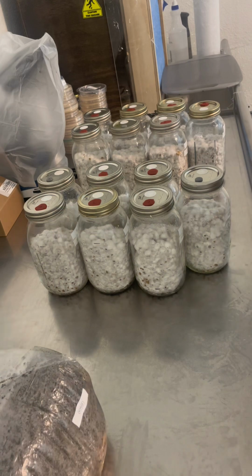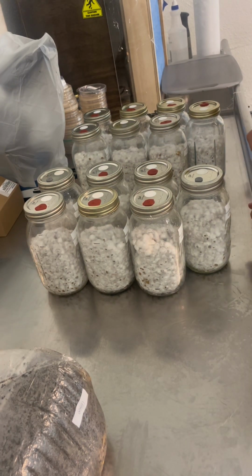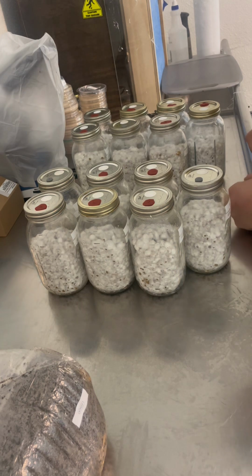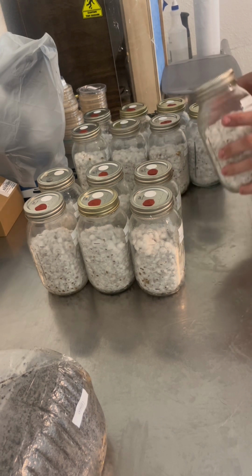All right, guys, we're back again. The date is January 7th. These were inoculated on December 18th, so it has been 20 days. And these are almost ready. They'll all be ready in the next 1 to 2 days, but you know, I'm kind of surprised.